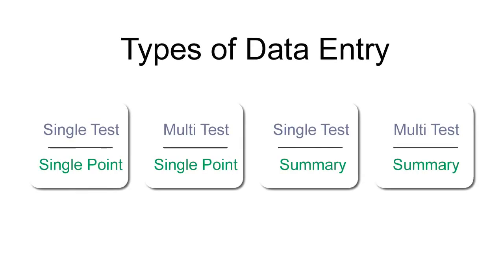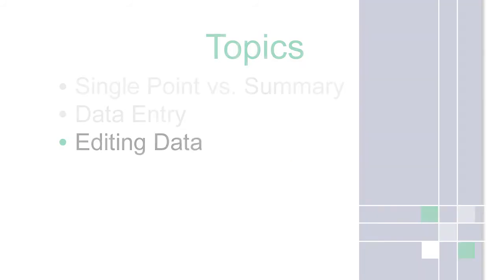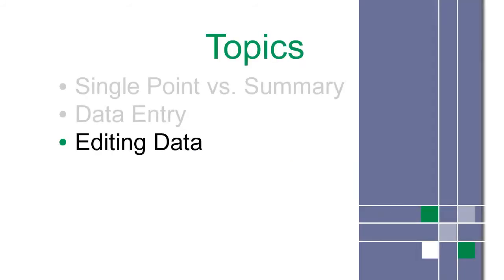Now that we've looked at all four types of data entry, choose what's right for you. Finally, let's look at editing data.